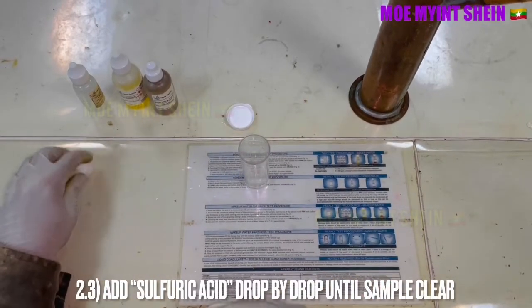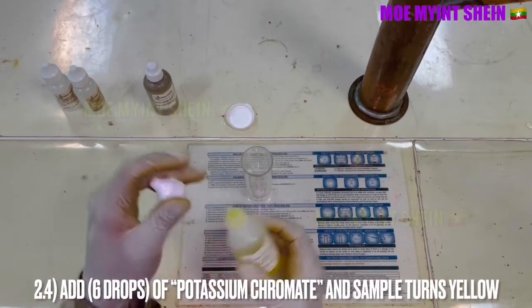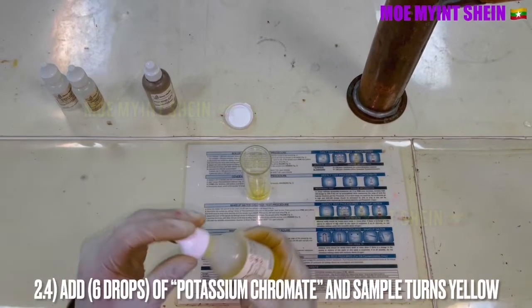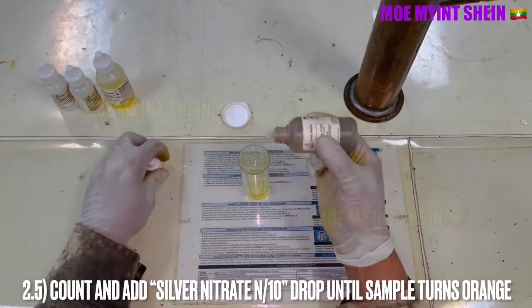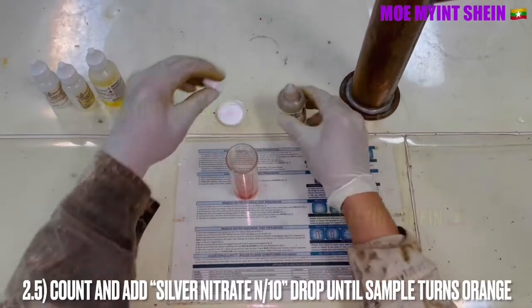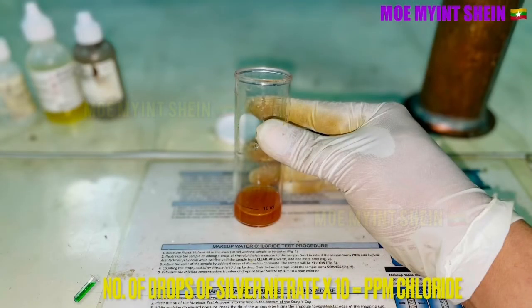Add sulfuric acid drop by drop until the sample is clear. After that, add six drops of potassium chromate — the sample will turn yellow. Count and add silver nitrate drop by drop until the sample turns orange. Chloride ppm is obtained by multiplying the number of silver nitrate drops by 10.